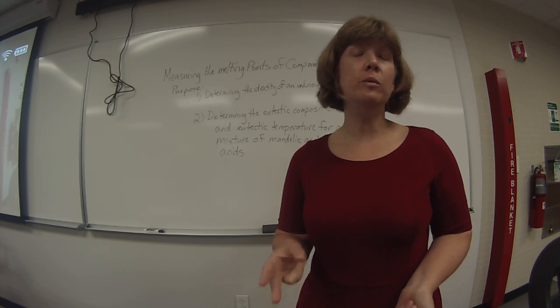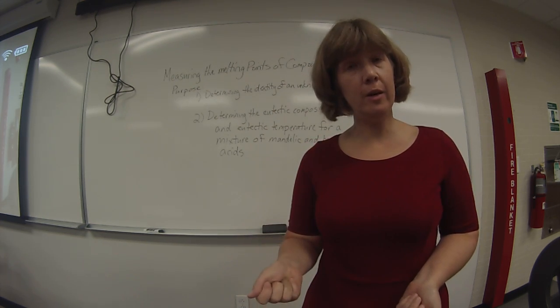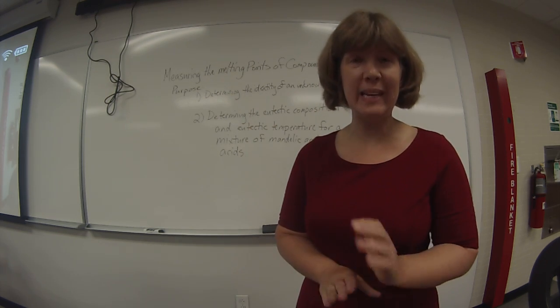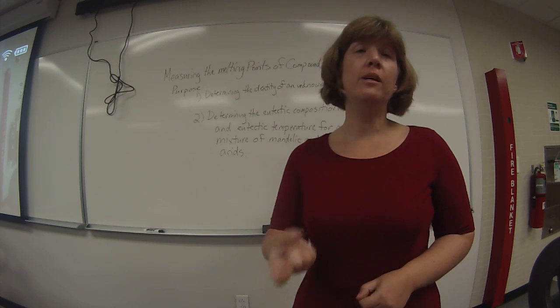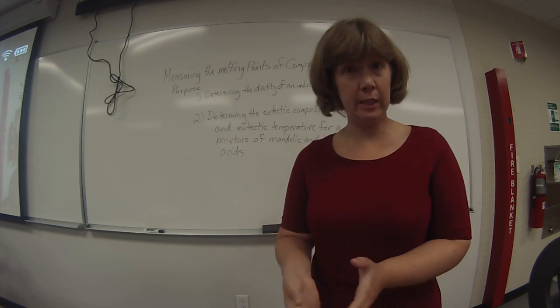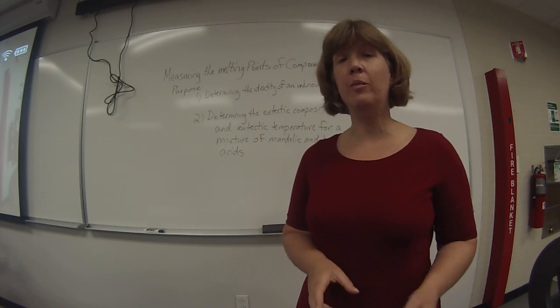The other 2 tubes contain the pure substance, which is your pure unknown, and then your unknown that's mixed with another substance that's the same as itself. In other words, still a pure substance. So, in this way you can figure out which of the 2 compounds is the same as your unknown, and which of the 2 compounds is different from your unknown.